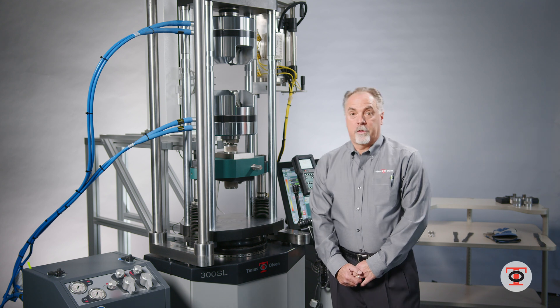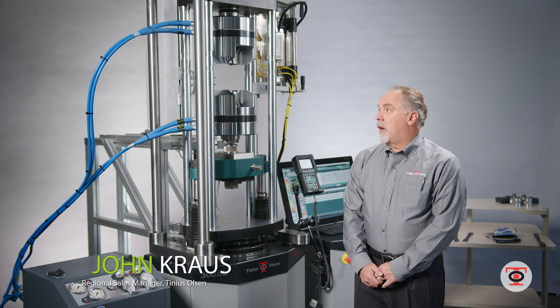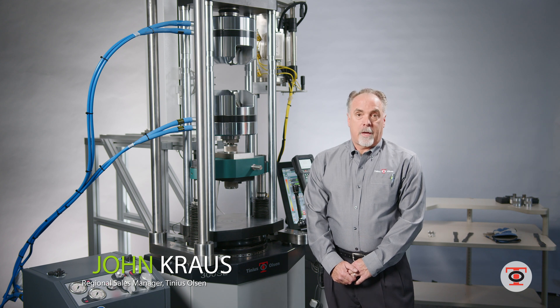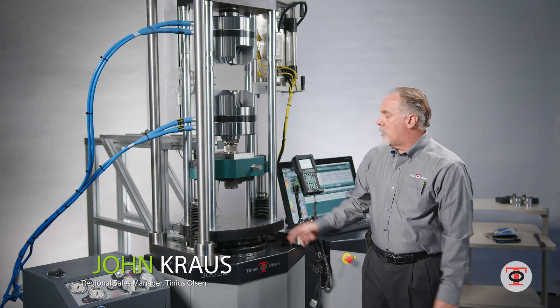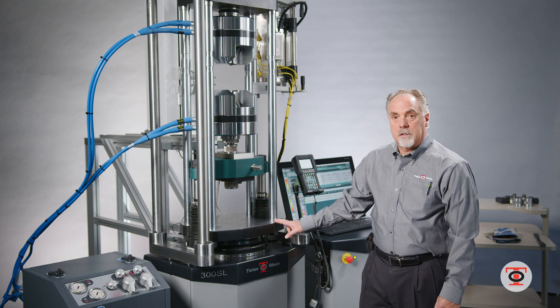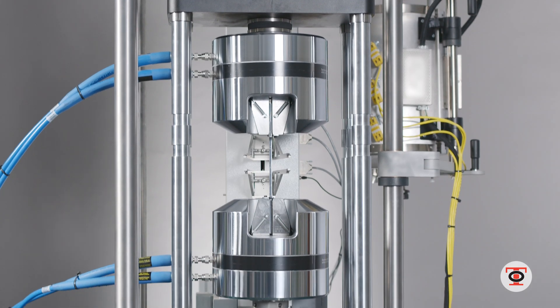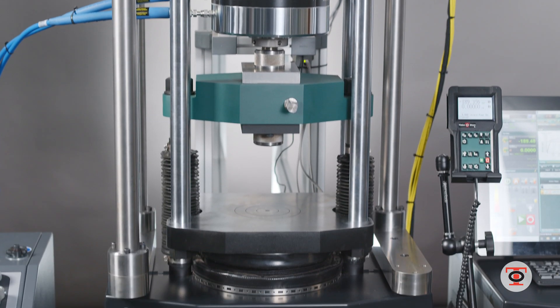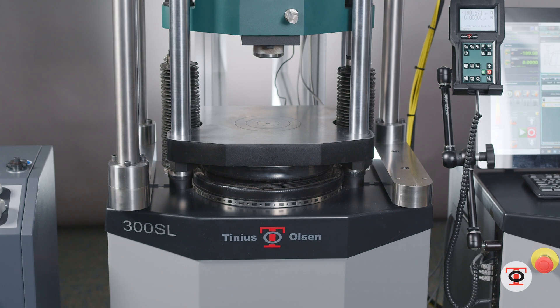Hi, my name is John Kraus with Tinius Olsen. I've been at Tinius Olsen for 20 years and I'm here to talk about hydraulic machines and our hydraulic line of Tinius Olsen testing machines. This is a 300 kilonewton SL, 60,000 pound capacity. We also have a 150 kilonewton which is very similar to this machine.